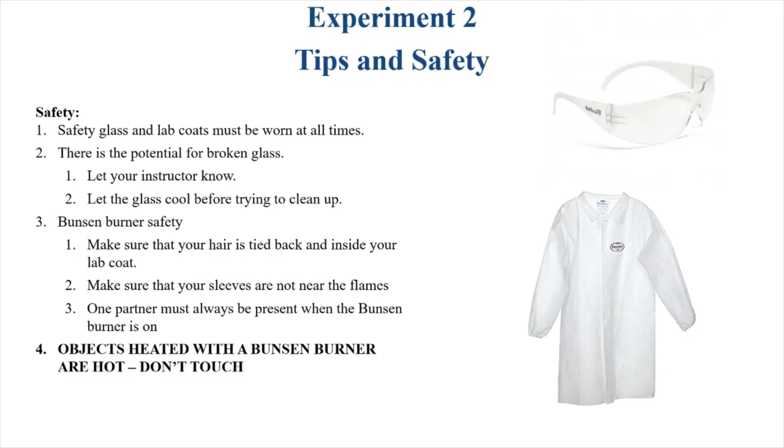So in this case, you need to have your safety glasses and lab coats on at all times. If you were doing this experiment, you would have to have those on at all times. The reason for this is that when we heat things up, things can react unexpectedly and they can react violently. So if your evaporating dish has a stress fracture and you begin to heat it up, it may crack or even explode. That's fairly rare, but it could happen. And then you have hot pieces of ceramic that fly around. That's why we wear safety glasses, to make sure that anything that bumps out of the experiment as we're heating doesn't go into our eyes.